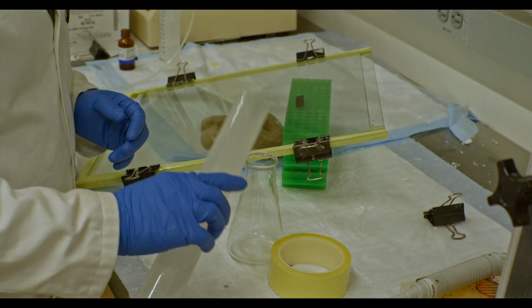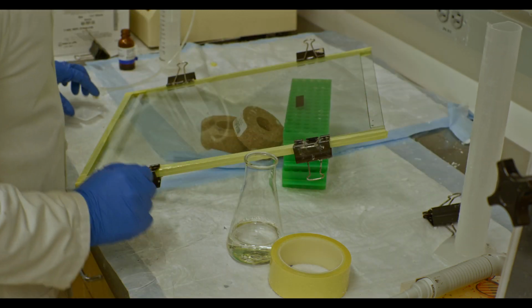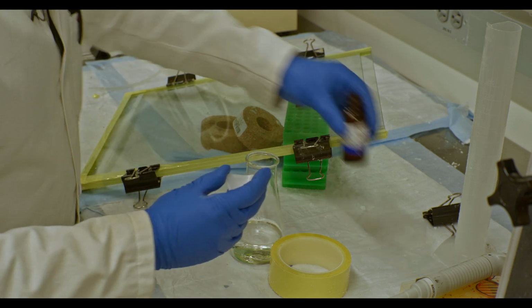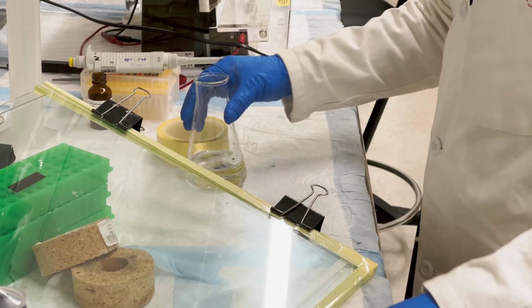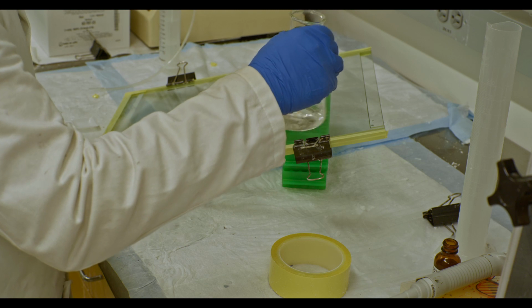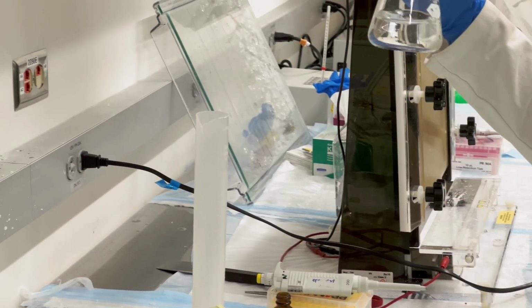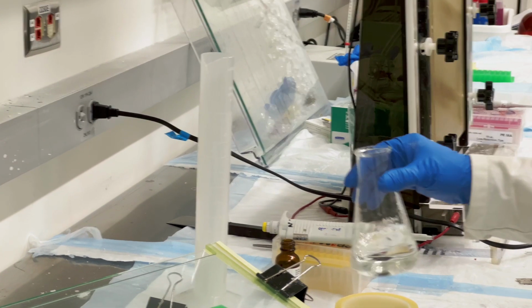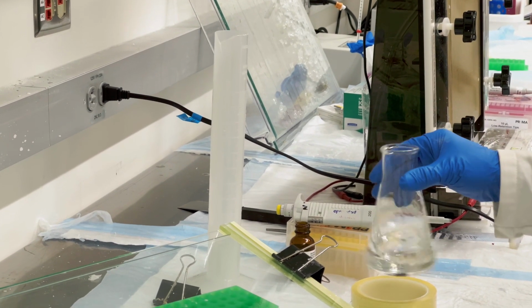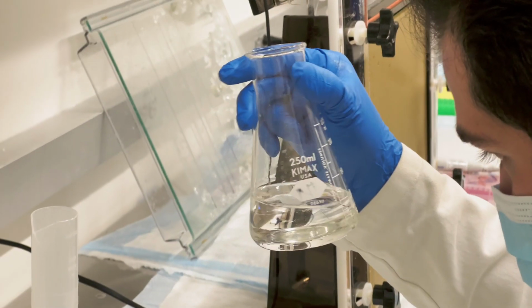Okay, so here we go. Here's 100 mL of a 20% PAGE solution into this 250 mL Erlenmeyer. Here I have about 85 milligrams of ammonium persulfate weighed out. Pour it into the Erlenmeyer and swirl. Again, this is a salt. It won't dissolve readily or quickly, so as you mix it, you hold the flask up to your eyes and see if the salt has effectively been dissolved. If it hasn't, keep stirring manually. It's almost there. This usually doesn't take more than a minute, but again, you want to be quick. There's one last little granule, and that's it right there.